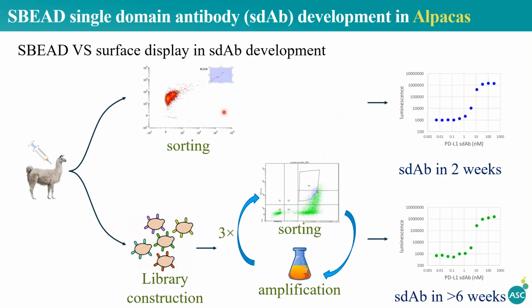When the IgG2, 3 enriched B cells were further sorted by antigen binding, we were able to develop single domain antibodies binding to the PD-L1 antigen with an affinity in the nanomolar range. When the cells from the same animal were used for single domain antibody development by yeast display, we were also able to obtain single domain antibodies with about the same affinity.